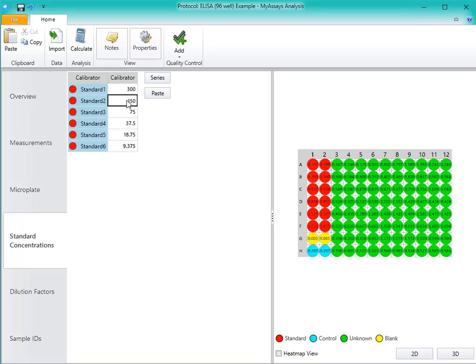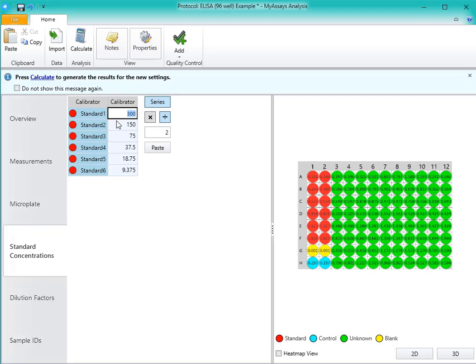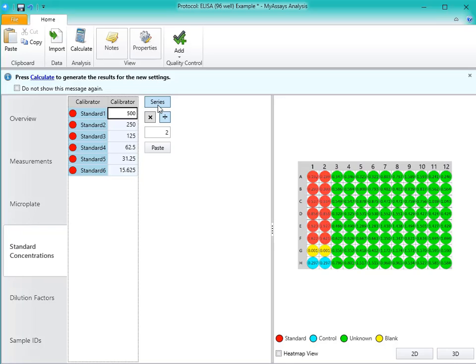With the Series mode, you can specify a starting concentration, and using the settings on the right, you can define how the next standard in the series should be calculated. For example, I could set my first standard concentration to be 500, and once I click Enter, each subsequent standard has been divided by 2.